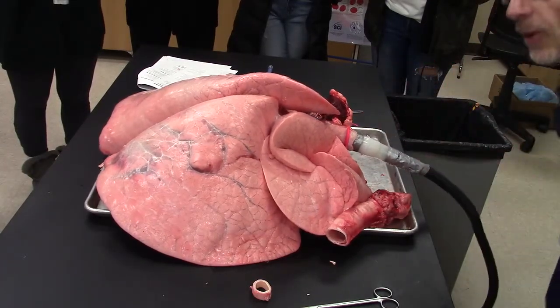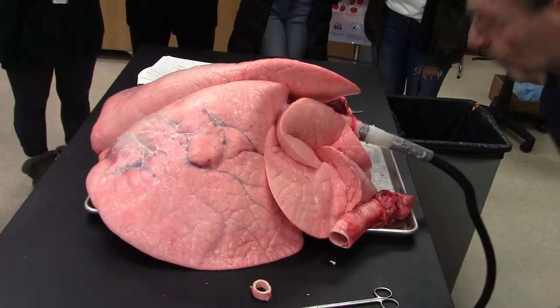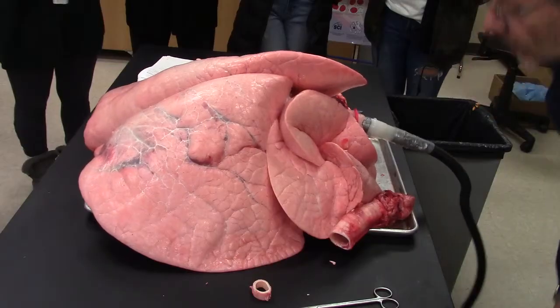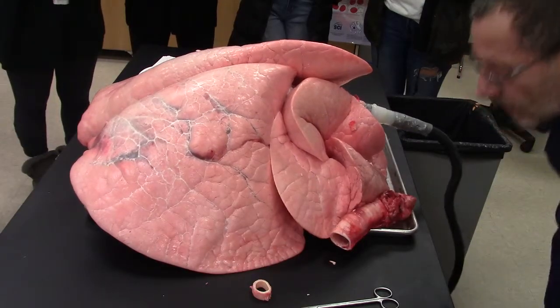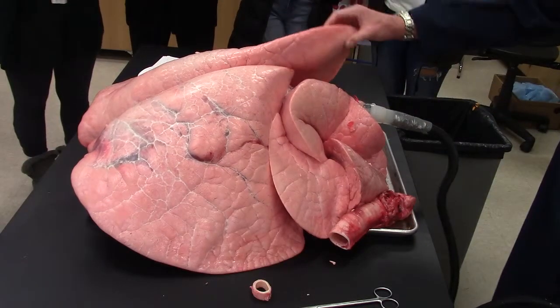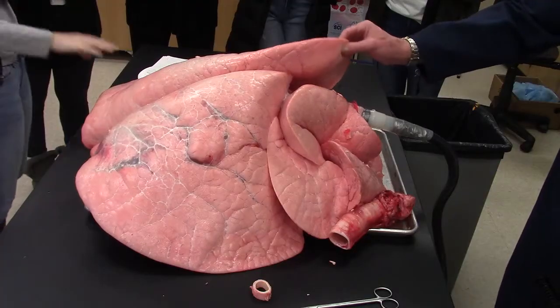These are nice and healthy lungs — non-smoker, youthful, maybe a bit of a couch potato in the feedlot. But that's what they should look like. You can go ahead and feel them, then just wash your hands before you eat your snacks.